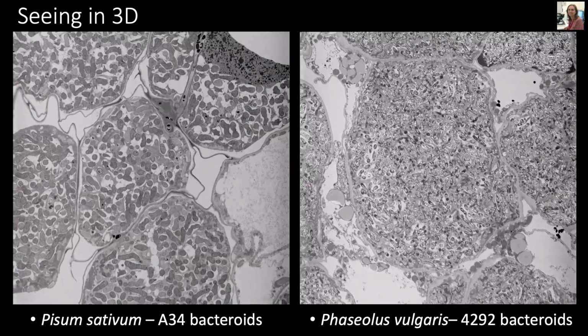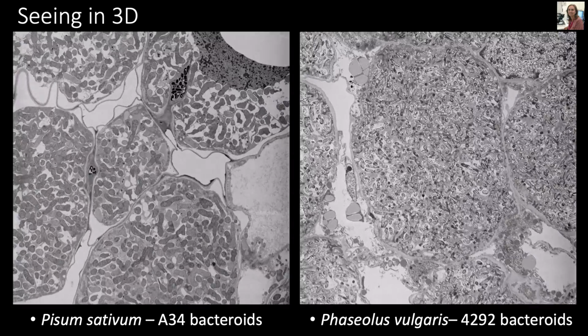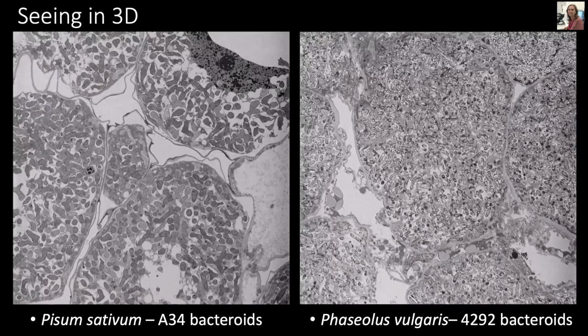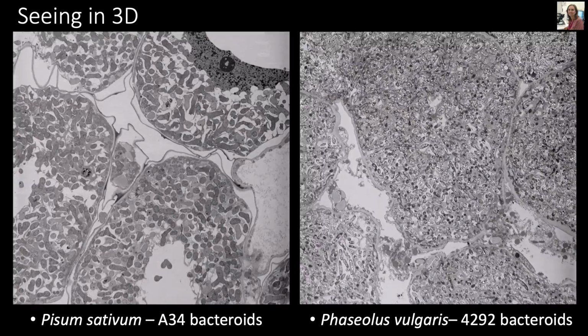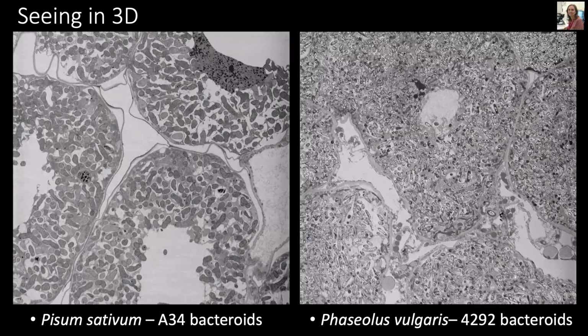And is this going to play? This one doesn't. So what you're seeing here now, we've taken these pea and these beans, and you're seeing these bacteroids, and now what we're doing is we're just sectioning down through the material. We're imaging one after the other, after the other, after the other. Now, I'm selling this a bit short, but this is amazing because you put it in and set it up, and then if it works, that's a very big if, you just walk away for a day, and it just sections and sections and sections. Then you worry about the size of hard drive you need to store the data, and then you need to process the data. I also feel really bad. There's a bigger picture of her later, but this is all possible because of Flavia Late.